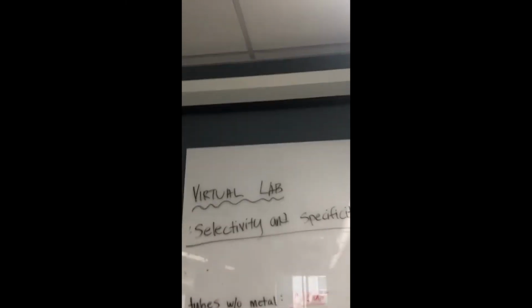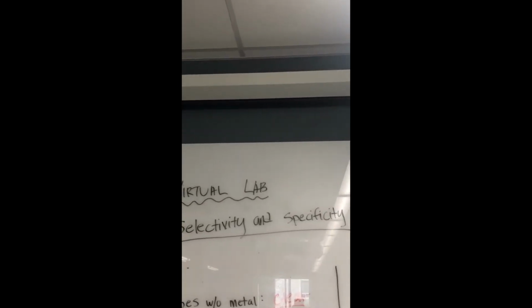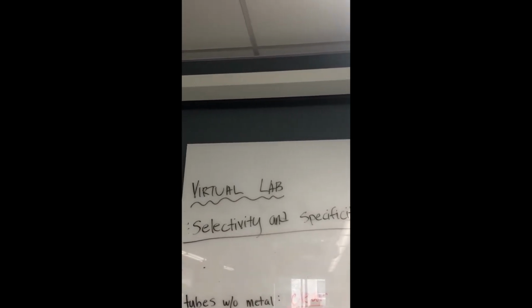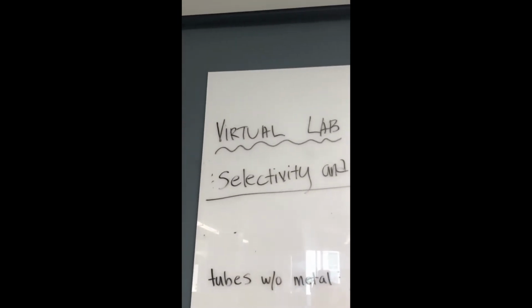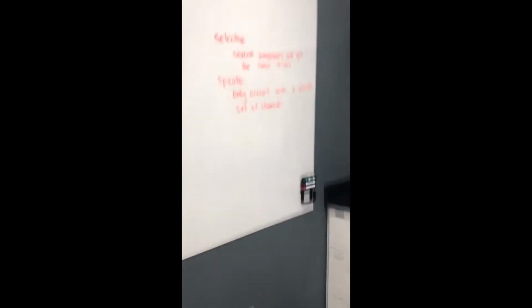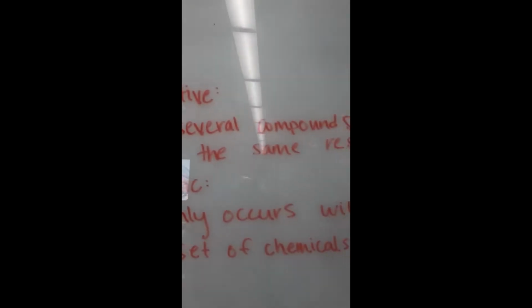Hey guys, so for today's virtual lab, we're going to take another look at chemical tests like we did last week. Only now we're going to look closer at one test and try to determine whether or not it is selective or specific.